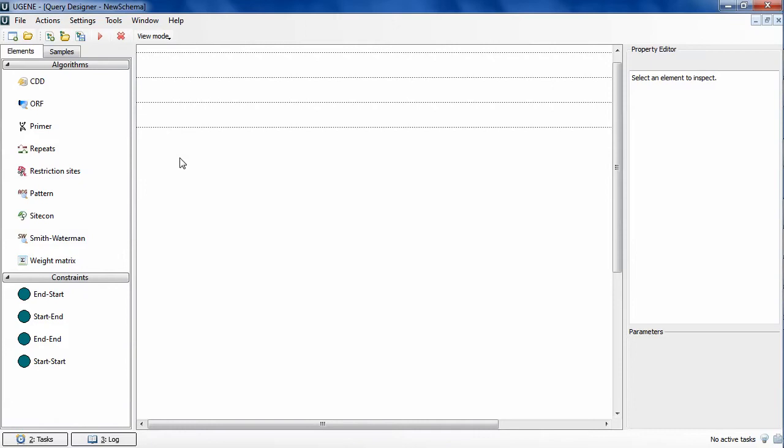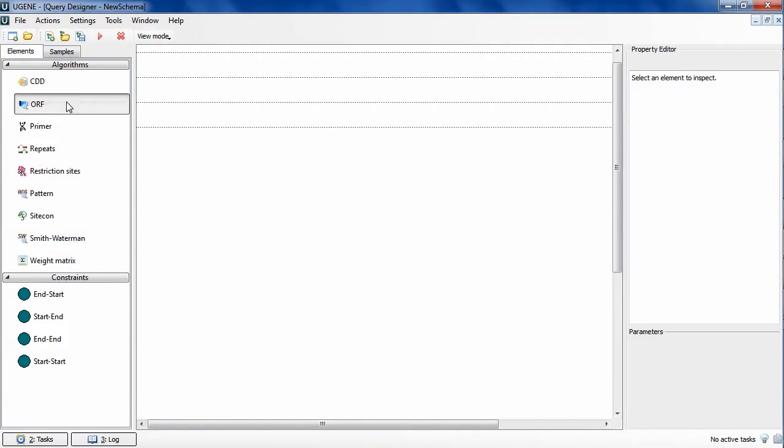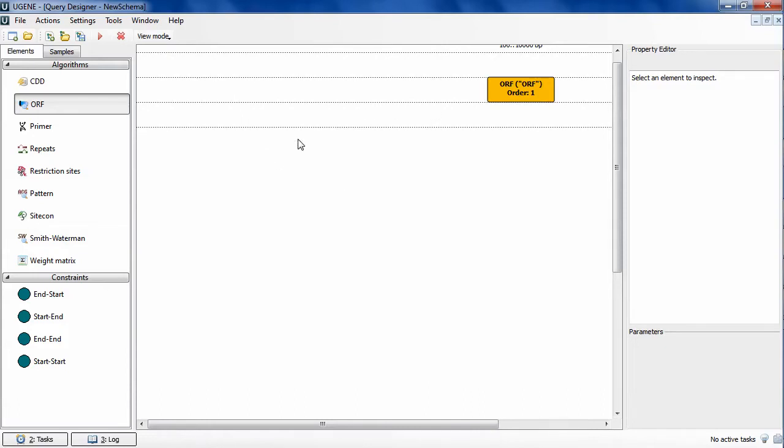I will start by clicking on the ORF algorithm element at the palette panel and dragging this element onto the schema. A new empty schema is created every time the query designer is launched. Then I drag the sitecon element onto the schema.